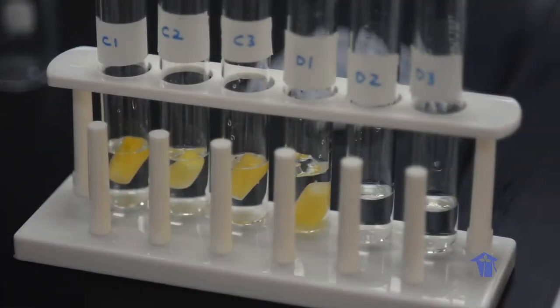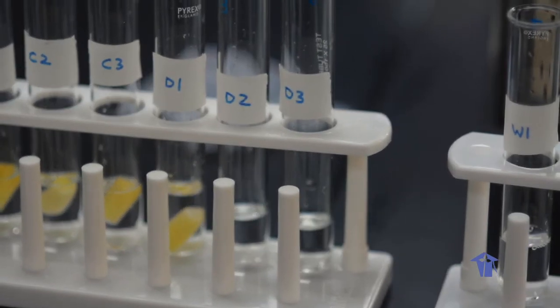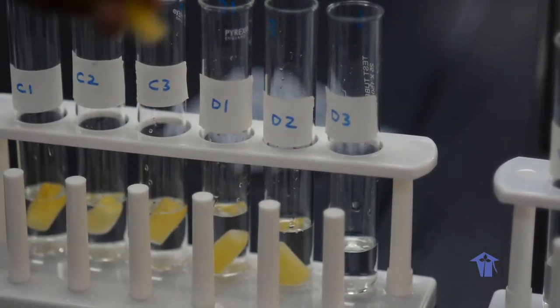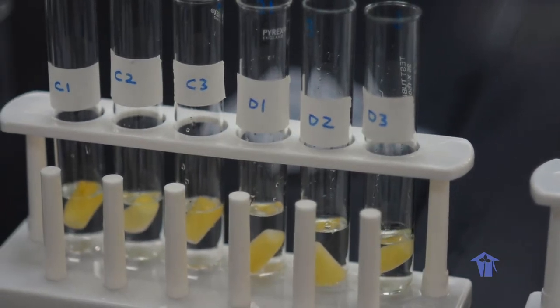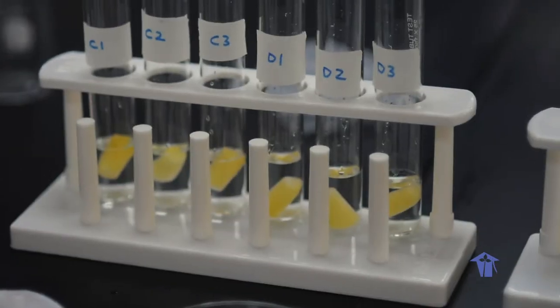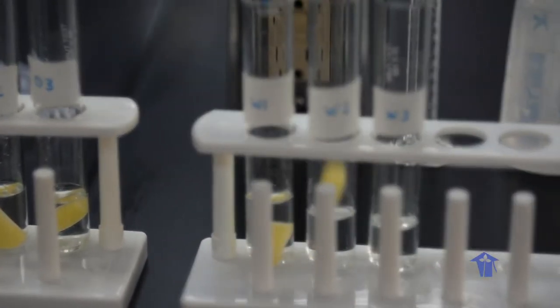Next, I'm putting in my potatoes into the dilute solution. And finally, I'm going to put these into the distilled water.